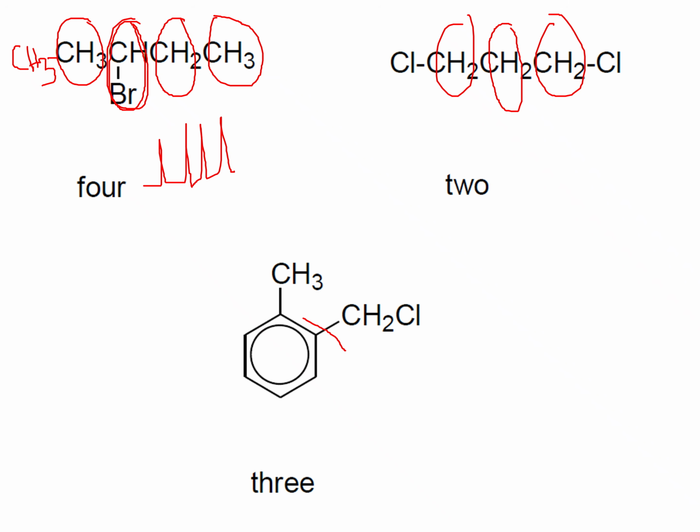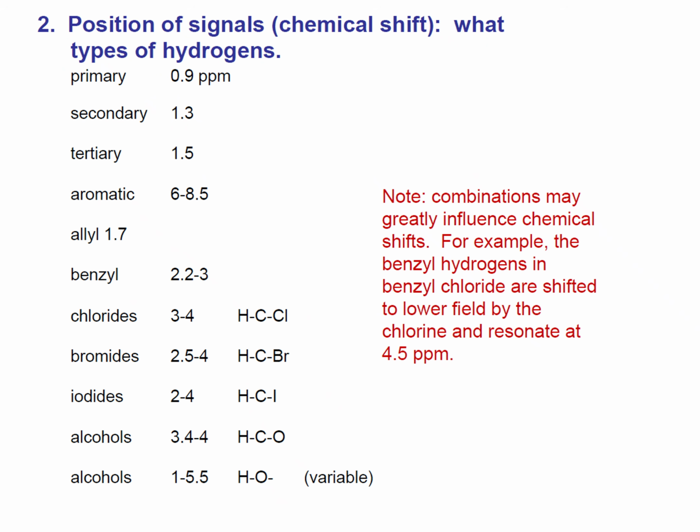Here are three environments. Why? Because the overall benzene structure will have the same environment of hydrogen, because here is one hydrogen, here is one hydrogen in the benzene structure, we know. All of them will have the same environment because of the benzene delocalized structure, and the other will have another environment. So the more environments, the more peaks in NMR. Okay, so we can easily understand the number of signals. Number of signals means the environments of the hydrogen.